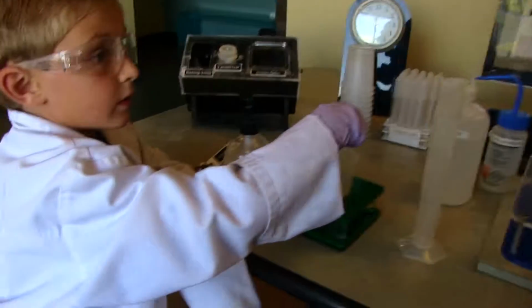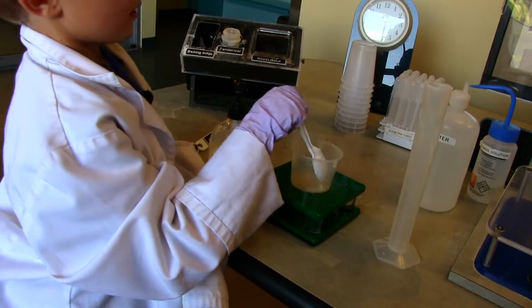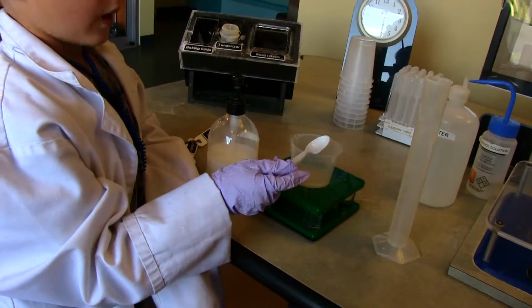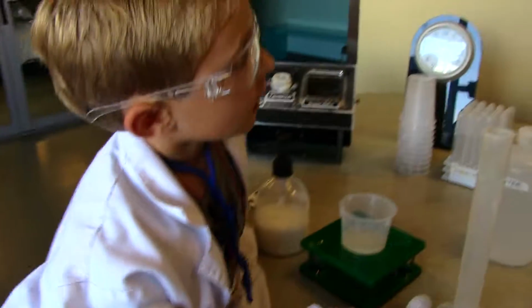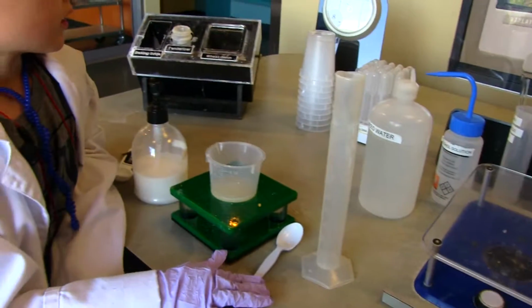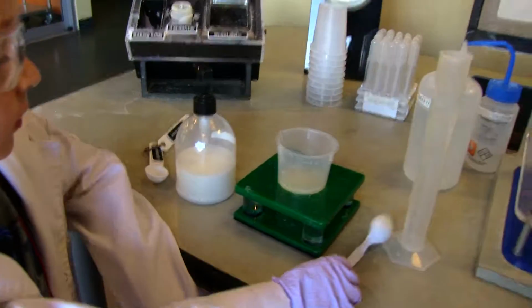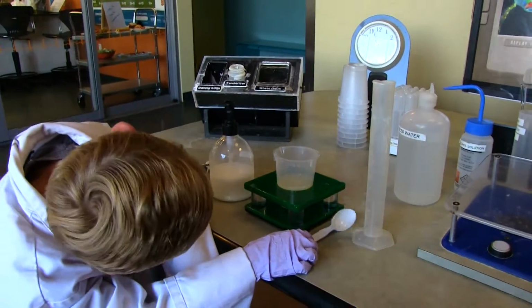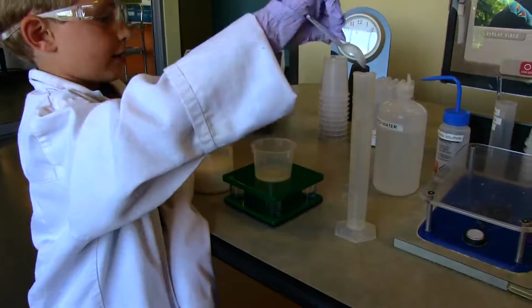Okay. Allow the wheat germ to settle into the bottom. Take the spoon out. It will take about 2 minutes. And then do what? And then, I guess just set it down there. Okay, now wait 2 minutes. Now what do we do? We're gonna wait 2 minutes so that this settles down to the bottom. And then what do we do?